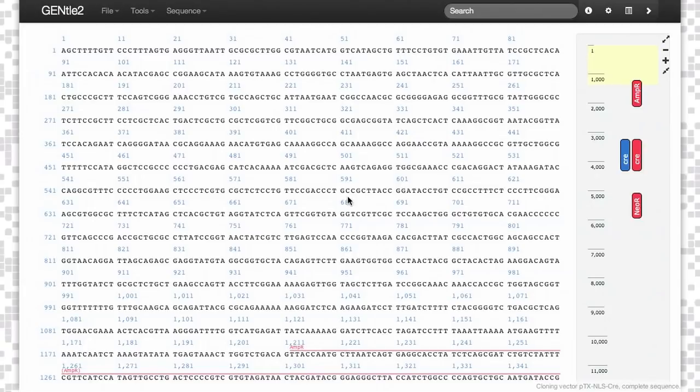A powerful feature in Gentle that will become more important as we move forward in development is annotation of your DNA sequence.